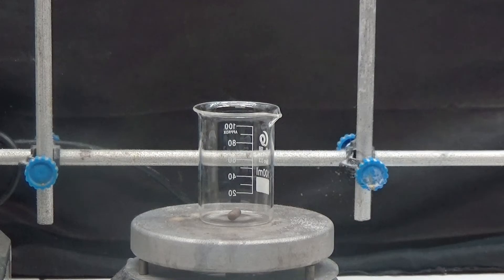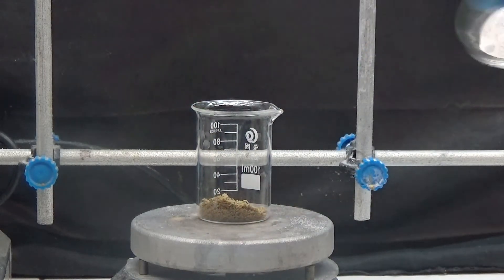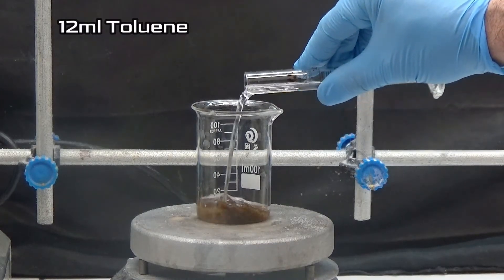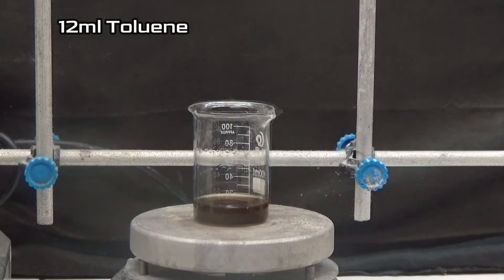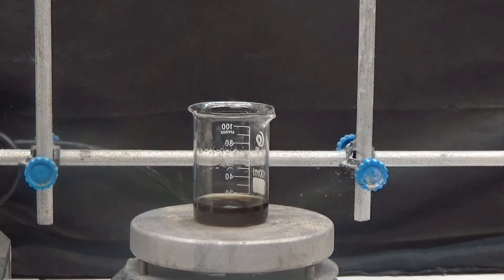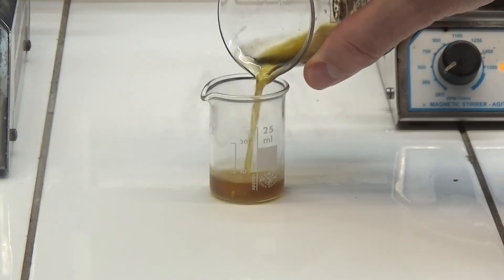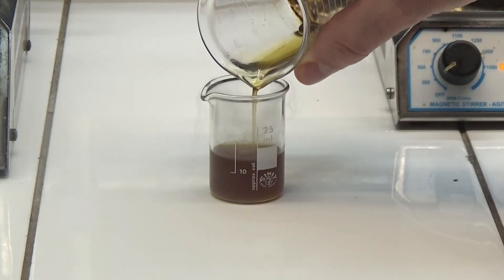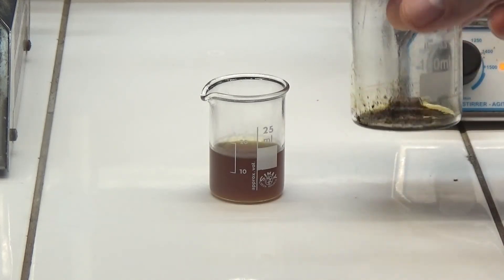To purify the catechol we are going to recrystallize it from toluene. Put the catechol obtained in a 100 milliliters beaker and add 12 milliliters of toluene. Heat until all the solid is dissolved. Put the hot solution in a 10 milliliters beaker. In the 100 milliliters beaker there remains a black residue at the bottom. We let it cool so that the catechol crystallizes.